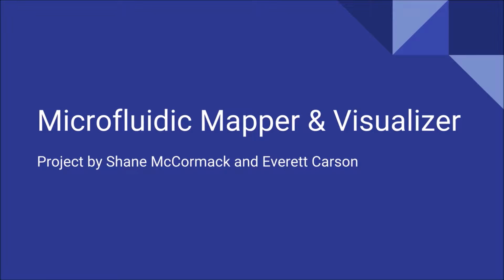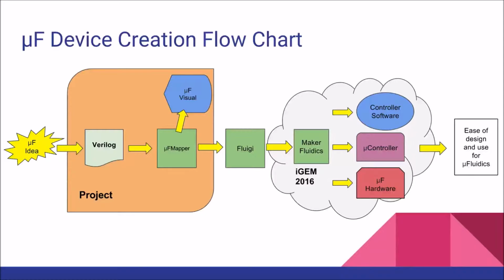Today, I'll be walking through a microfluidic design, mapping, and visualization tool. Widespread use of microfluidics could potentially catalyze great advancements in the automation and efficiency of simple lab processes. However, as of now, microfluidics are generally avoided due to their complicated design process and steep build cost. Our project has the primary goal of easing this design process for the end user.